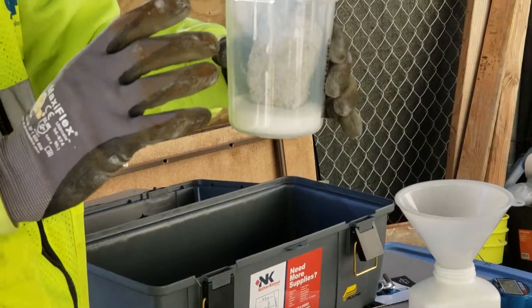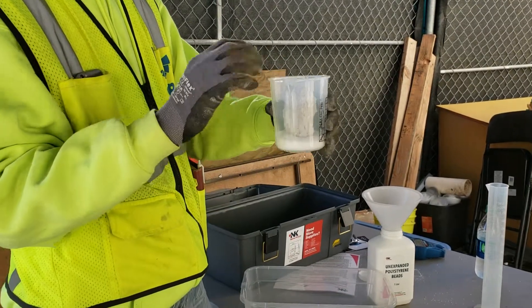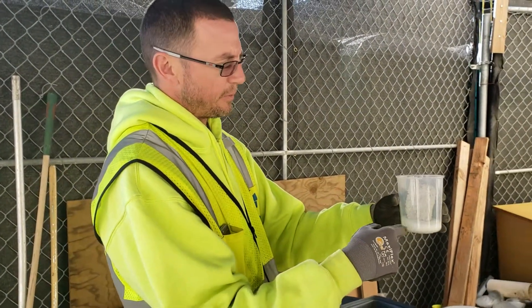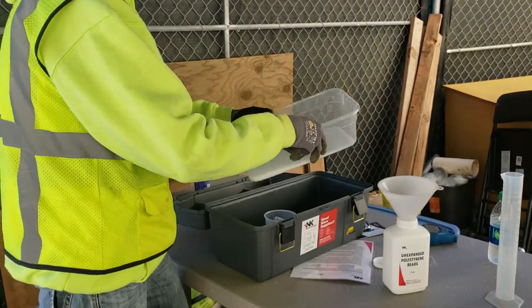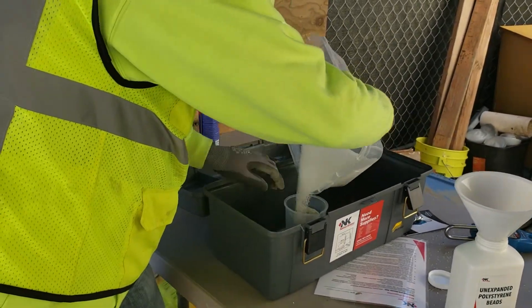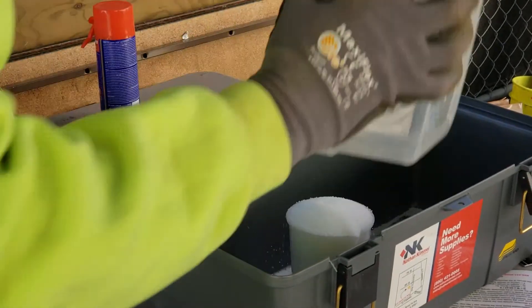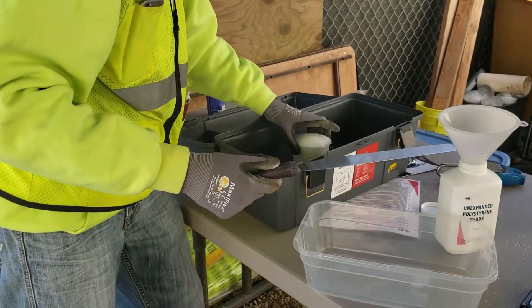The procedure is: you want the beads to surround the sample on all sides — bottom, top, and every side. We always want to leave some beads in the bottom. We pour the rest of the beads in there, get the sample surrounded, overfill it, and then trowel it off.